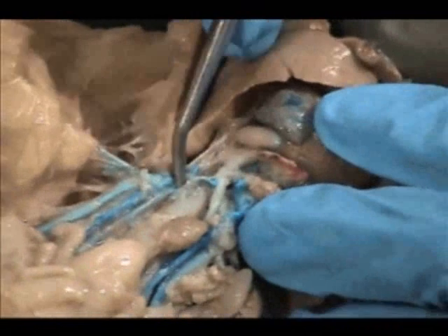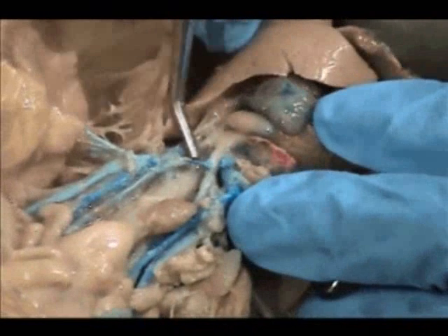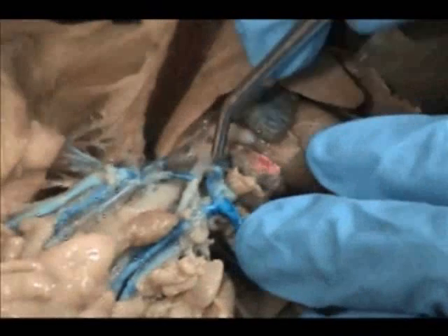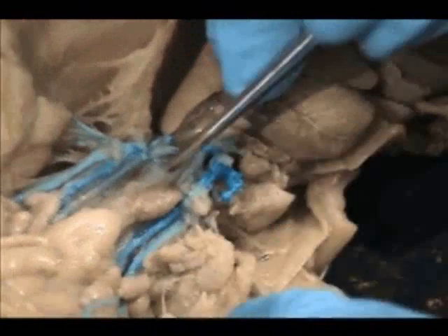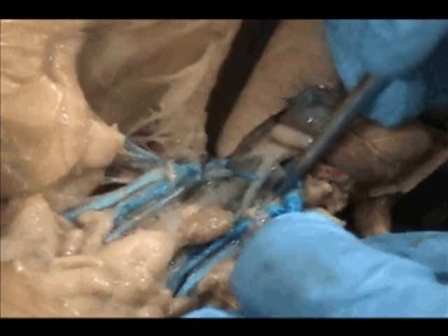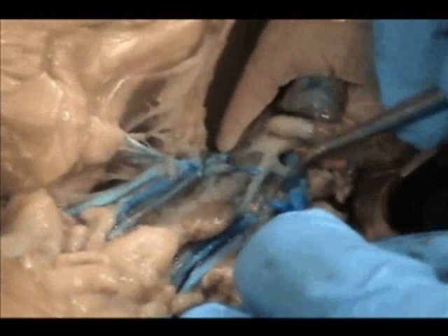Remember, your bicarotid trunk — here it is. Here's your common carotid on the left, and here is your common carotid on the right. There's unfortunately been a little cut right here; hopefully that will not happen to you. This is where they join at the Y, so be very careful. Now let's find the blood vessel that should be coming off in this area that feeds the arm — that's going to be called the subclavian, and it's actually this little one right here.